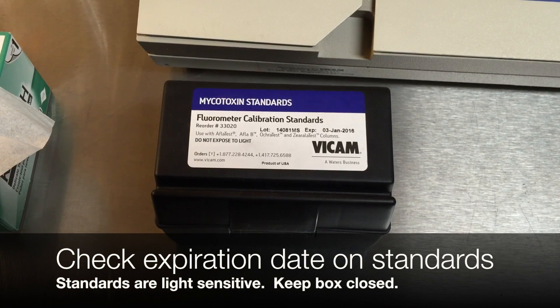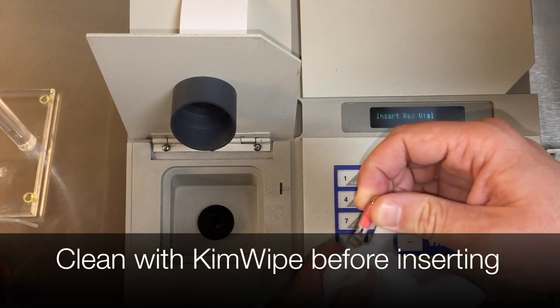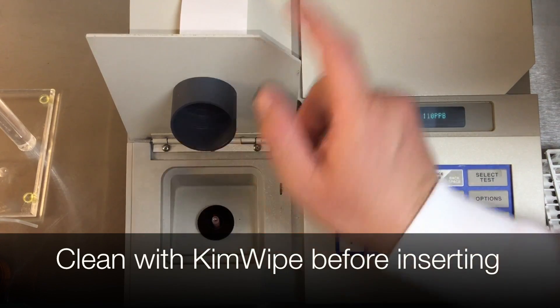Calibration depends on reliable standards. Check the standards box expiration date and keep the light-sensitive standards box closed when not in use. Anything inserted into the fluorometer must be cleaned with a Kim wipe.